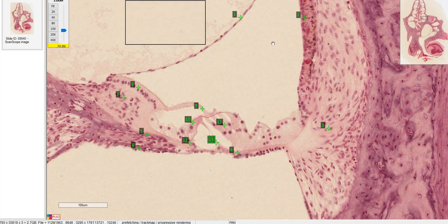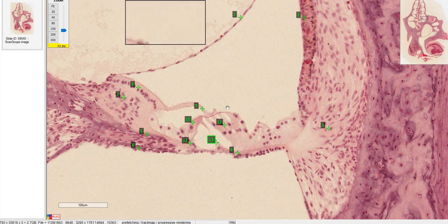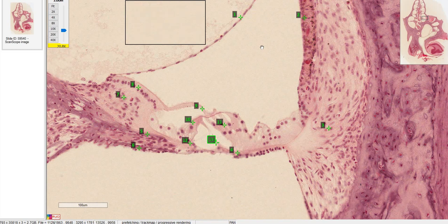I realize that was a lot of different structures, so now I'm going to run through each of them on the other side of the modiolus. If you want to quiz yourself, pause the video before I go through the answers — here's your chance.